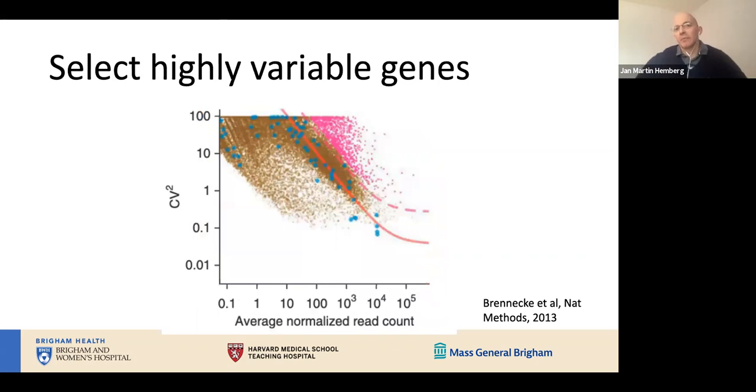This is an example of what's called feature selection. By feature, we mean gene here, really. The idea is not to consider all of the genes in your sample, but only a subset. One of the things you should always do is look at the genes that are really lowly represented. Typically you would use a threshold of a few percent. So if a gene is present in no more than a few percent of the cells, you just take it out altogether. That can typically reduce the number of genes by a few thousand. It really depends on how deeply sequenced it is.